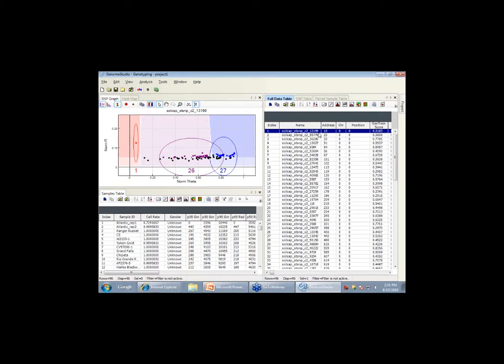What you're going to see in the Infinium array that SolCAP is generating is that there are actually 10,000 data points on this array, and it will represent about 8,300 different loci that we're interrogating. But it's still the same thing: one sample, 8,300 loci. In this case, there are 96 lines. If you scroll around to the bottom here, there are 96 different SNPs that have been interrogated.